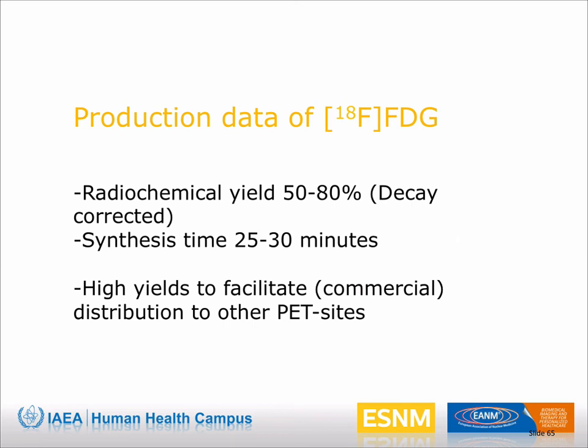After the radiosynthesis, quality control is being performed in order to assess if the radiopharmaceutical meets the criteria as described in the pharmacopoeia. If FDG complies with the requirements, the qualified person will release FDG for human use. As the workhorse tracer of PET can be produced in large amounts, up to several hundreds of gigabecquerel, FDG can easily be distributed to PET sites without a cyclotron, located within 2 or 3 hours from the production site.